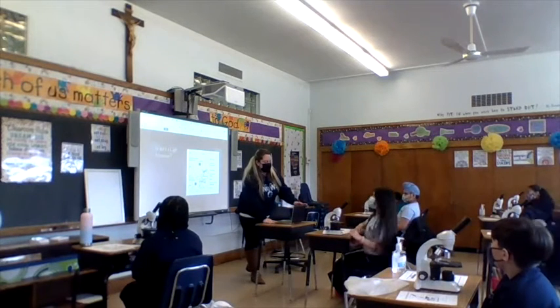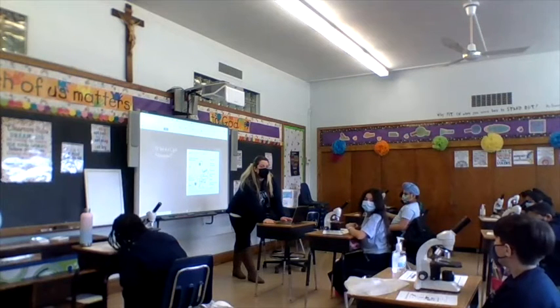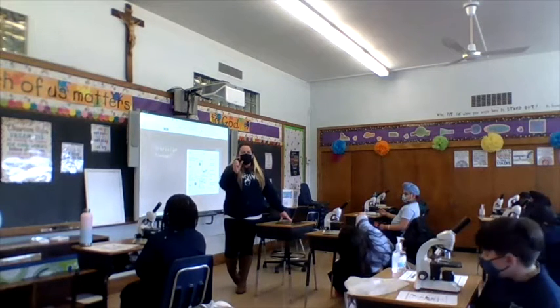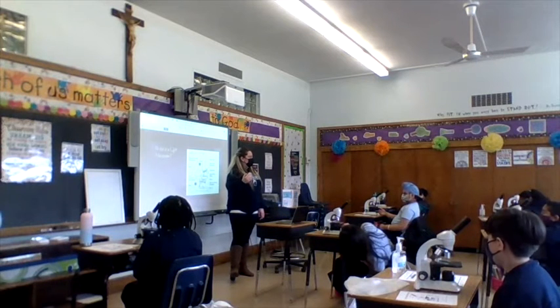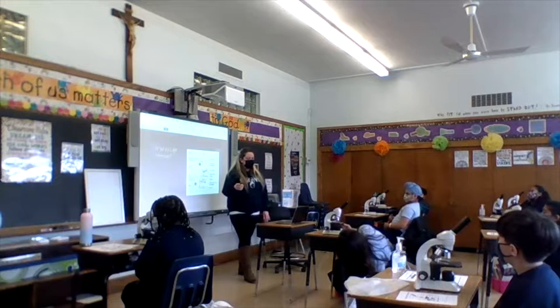Okay, question so far? A question? Yes. I noticed that under the base there's like a wheel pattern. Yes, so there is a wheel, and it's also part of a way to focus it. Every microscope's different, right? So these are all the same, but Malik's at home might be a little bit different. Yes, Malik?